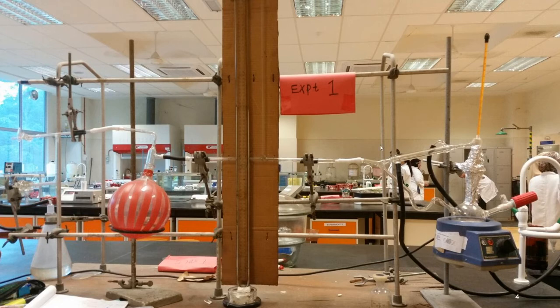Now this is what we call the vacuum line. And this is the manometer, where you actually get the data. This is just a protection to avoid the tert-butyl alcohol from going to the vacuum pump. It's actually much longer. We should see the vacuum pump somewhere in here.